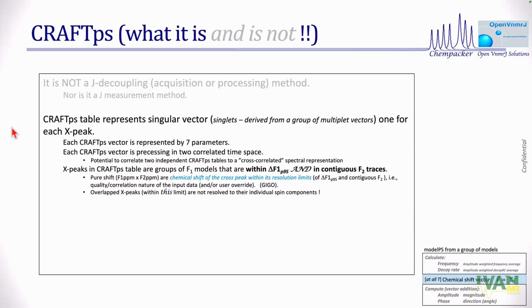For example, if you want to live with less conservative, more, pardon my pun, liberal, use delta F1, where you simply say, well, I'm willing to live within the average uncertainty, not necessarily the 95th or the 68th percentile.